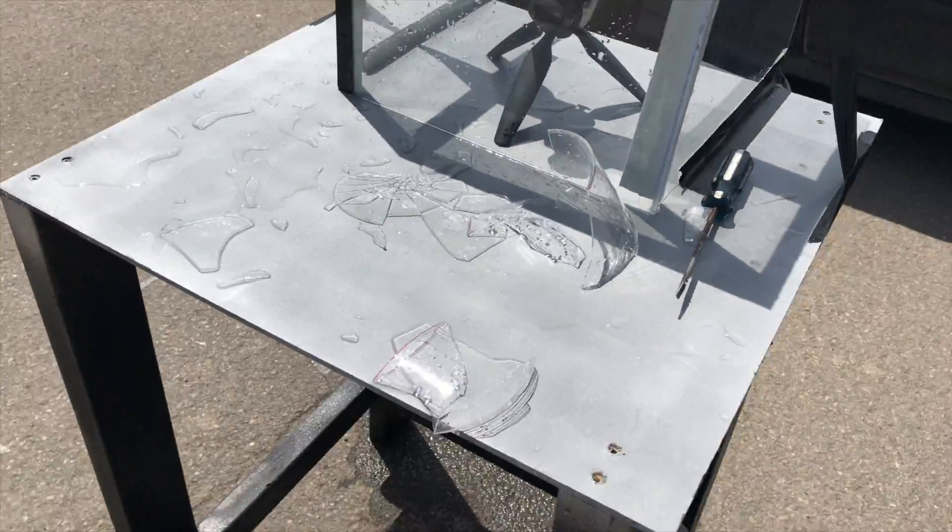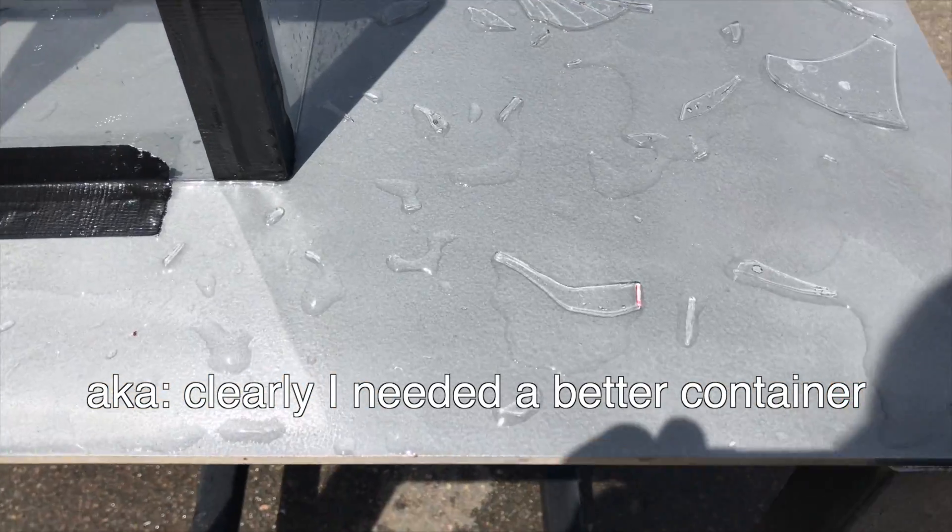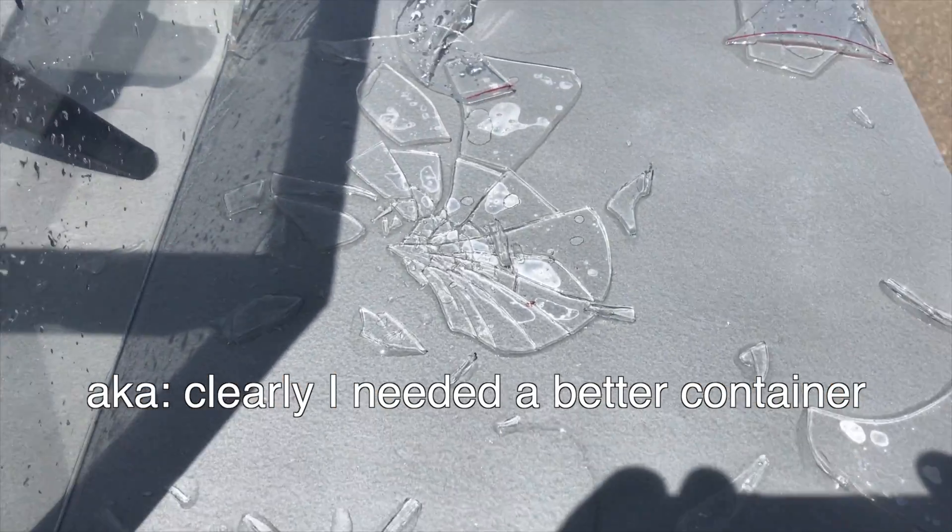Observation number seventeen: glass is not a suitable container for alkali metal with water explosions. Why don't we try this again but with a plastic container?